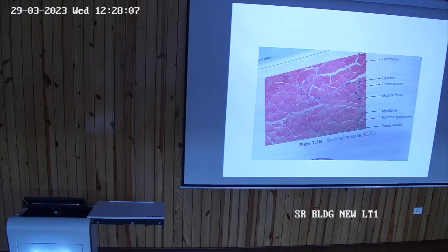When we see the inner part of the muscle, there are bundles of muscle fibers, and each bundle of muscle fibers is surrounded by perimysium. Okay. Third thing, now see the single muscle fiber. What is the bundle of muscle fiber? That is the bundle of the muscle fiber. So see any muscle fiber. The muscle fiber itself is covered by another connective tissue layer, and that is called endomysium. Okay, all right.